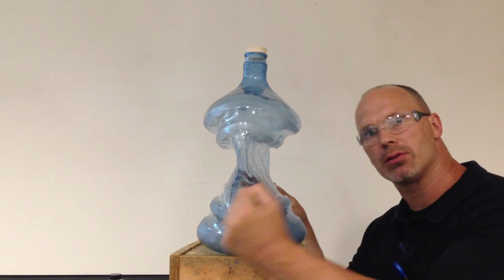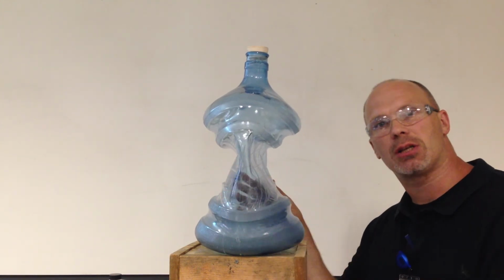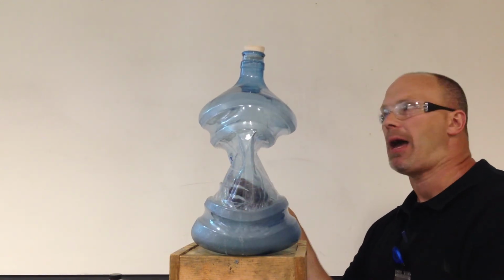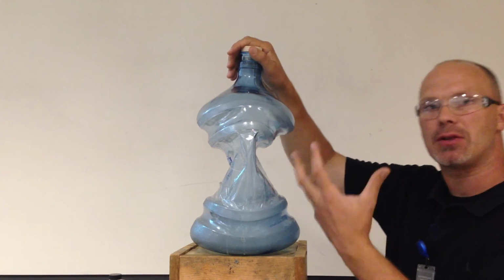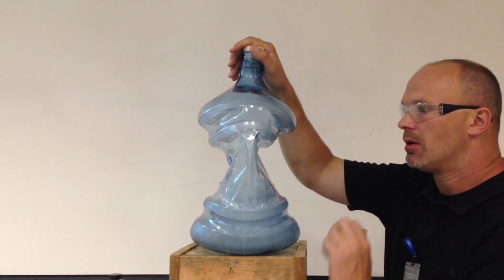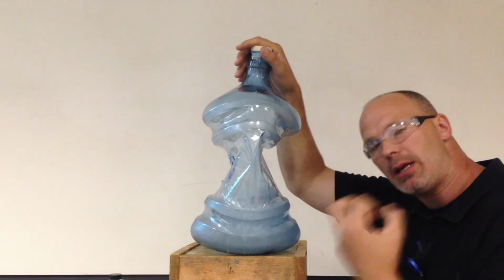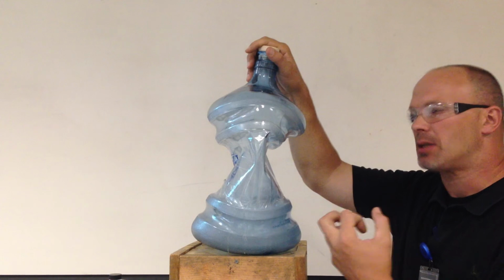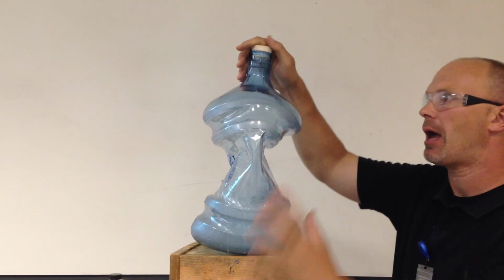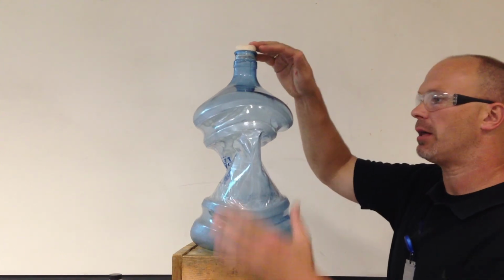Now pressure is due to molecules colliding. And we know there's pressure on the inside and pressure on the outside. That was initially the same. That's why the container didn't implode initially. But what happened was, by me creating this exothermic reaction that gave off heat, I created gases that expanded out, and the heat that was left in the container with fewer particles, because again, when you heat a gas, gases expand. And when they expanded out the opening, I was left with fewer gases initially, because it didn't happen right away. It only happened when I covered it. So the gases initially expanded out, but it didn't collapse until I covered it.